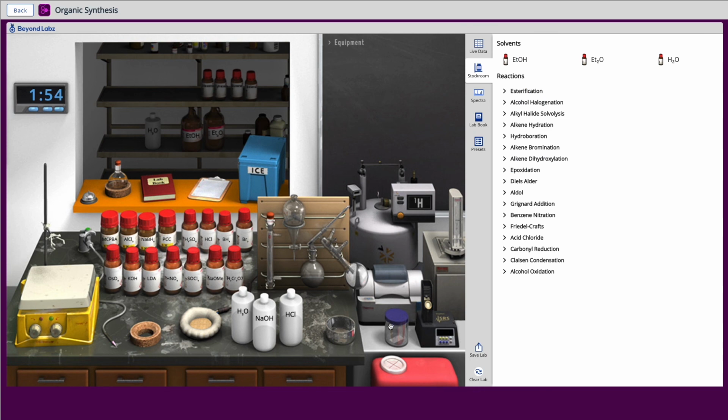That's a basic overview of the Organic Synthesis lab. If you want more information, check out our other videos and feel free to contact support.